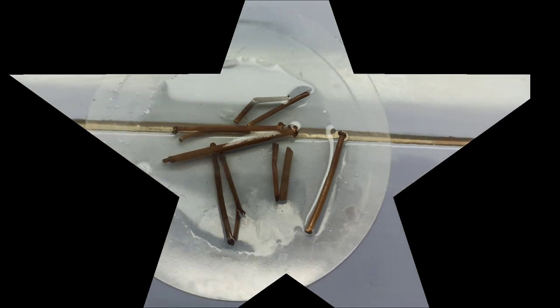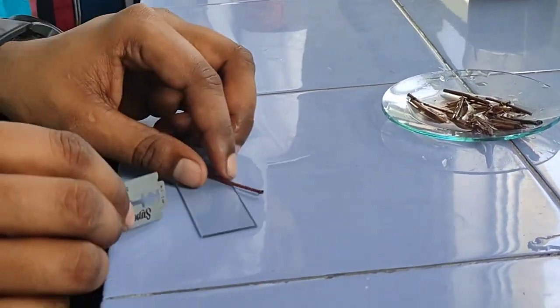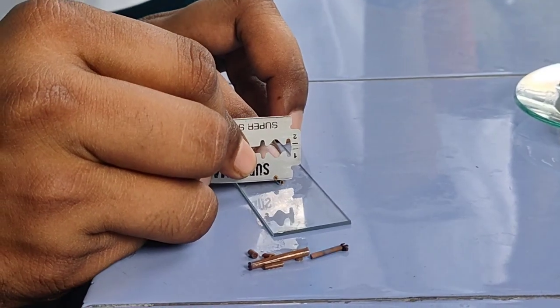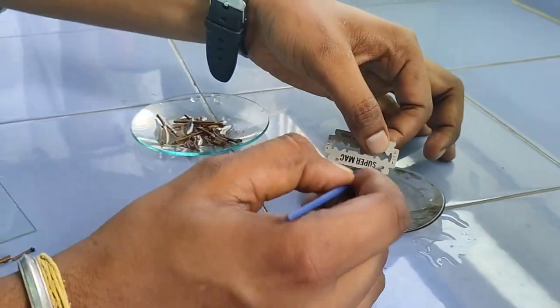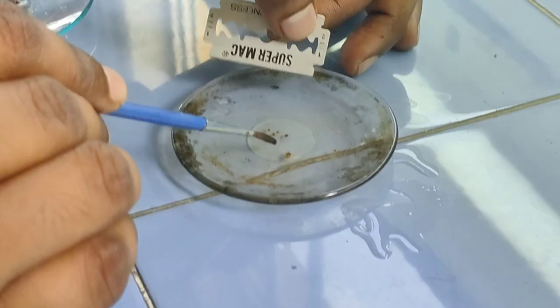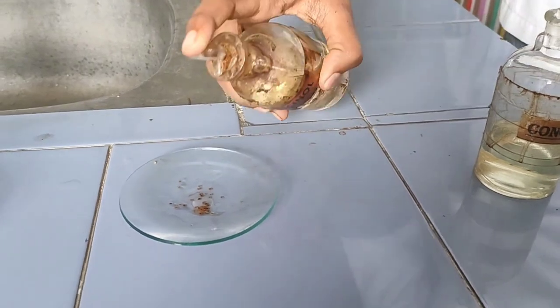Now let's study the transverse section of ephedra stem. Select a good stem and initially go for a hard cut followed by a thin section, as thin as possible. Now collect the thin section samples in a watch glass and add fluoroglucinol and concentrated HCl.